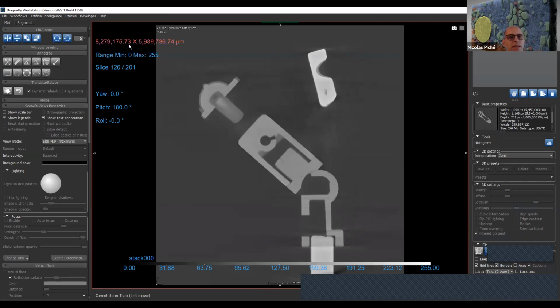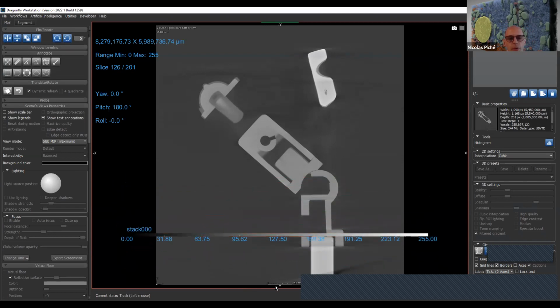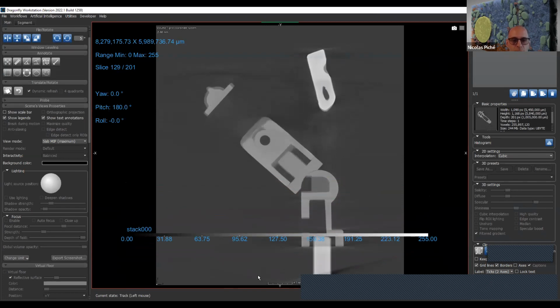First I will say that text or objects on screen that change color like that mean that they are interactive. So here I can move the lookup table. I can also change the scale. I think not in that format, since it's a scale burned in the image. Sorry. So, show scale bar. The scale bar that we have can be moved.